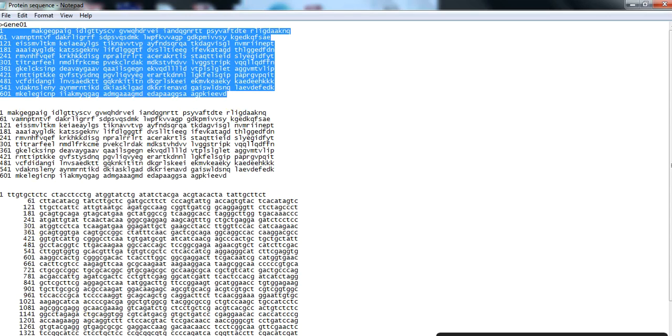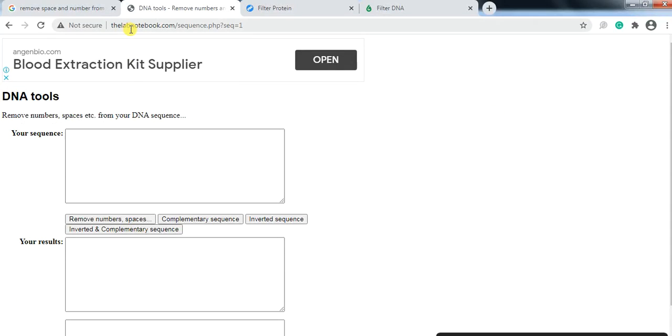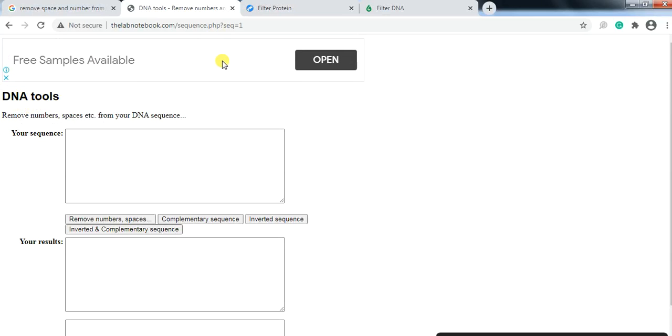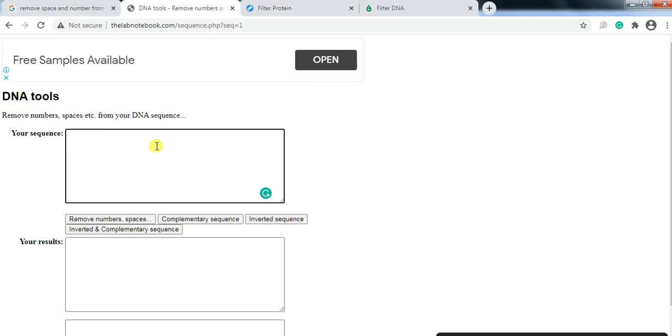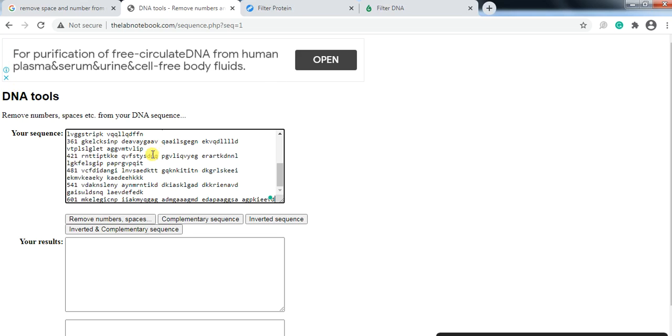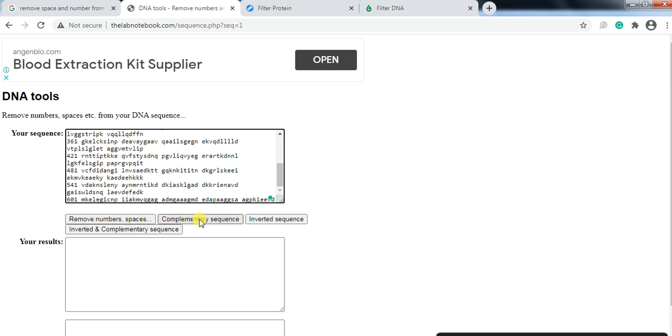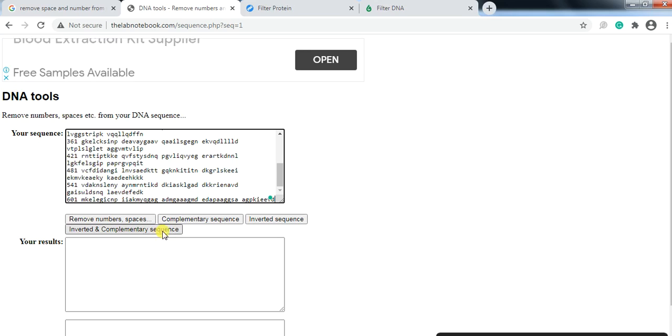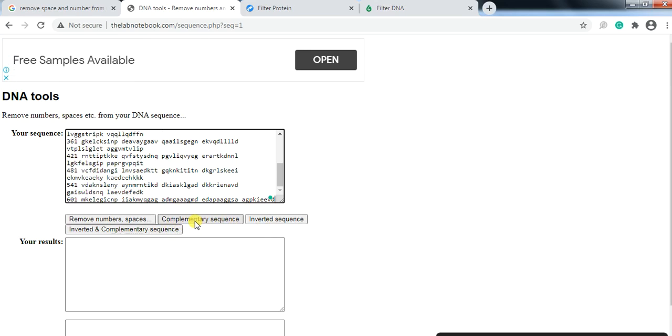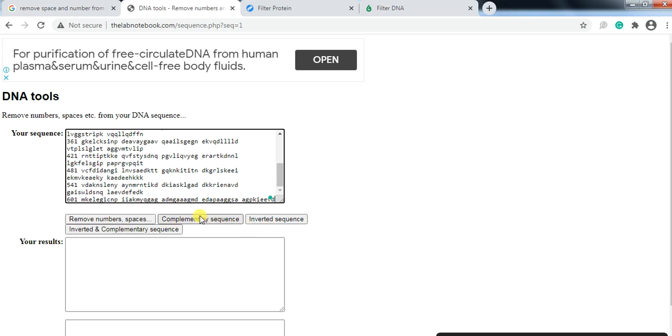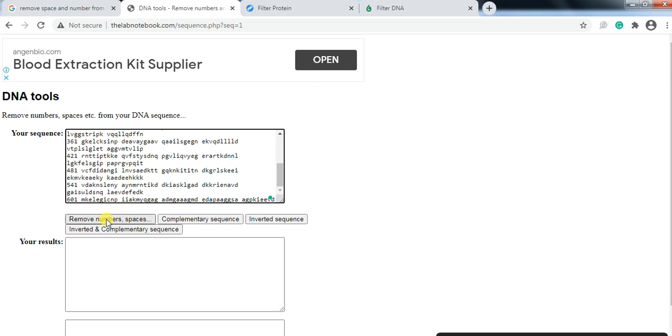Then go and open the DNA tool. The link is available in the video description. Then you can paste your sequence and here are some options: remove number and space only, or use the complementary sequence, inverted sequence, inverted complementary sequence - anyone that you want. You can use it often like complementary or inverted from your DNA sequence. Here I only want to remove the space and number, so click on it.